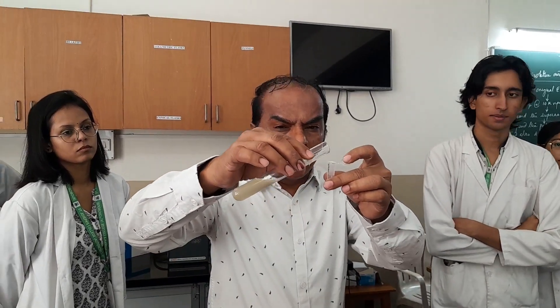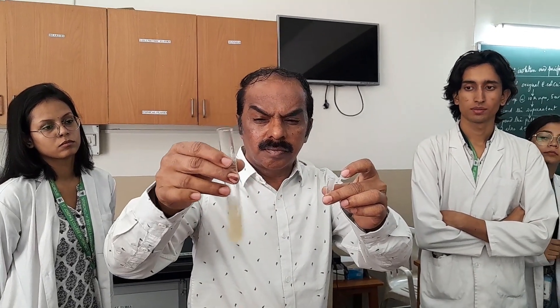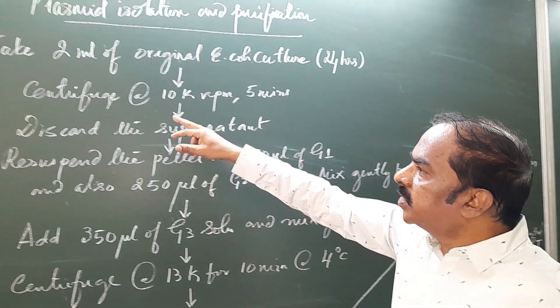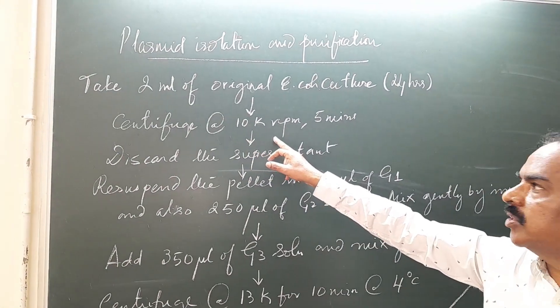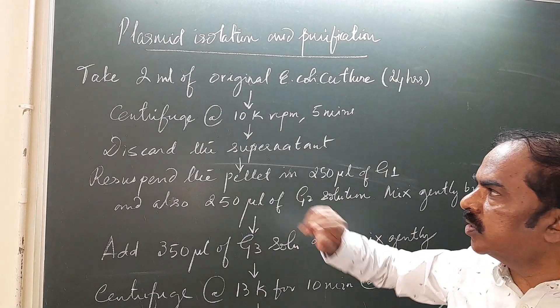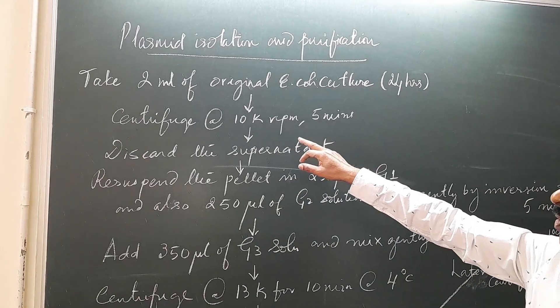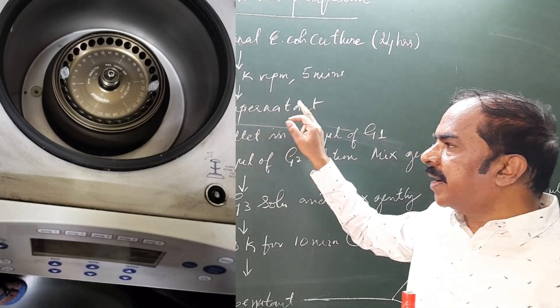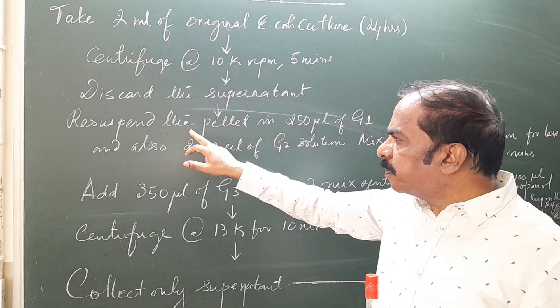First, we require two milliliters of E. coli culture. This is the E. coli culture which is ready. Centrifuge the culture at 10,000 rpm for 5 minutes using a cooling centrifuge. Then discard the supernatant and resuspend the pellet.